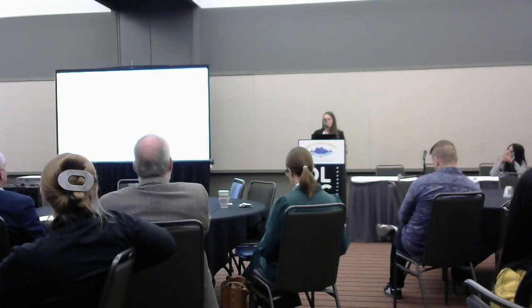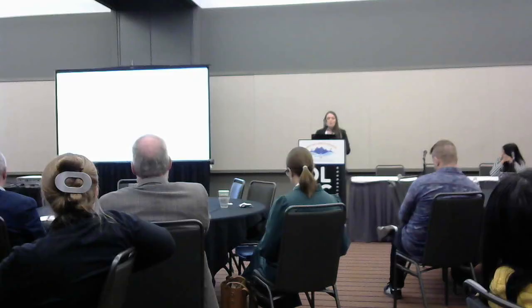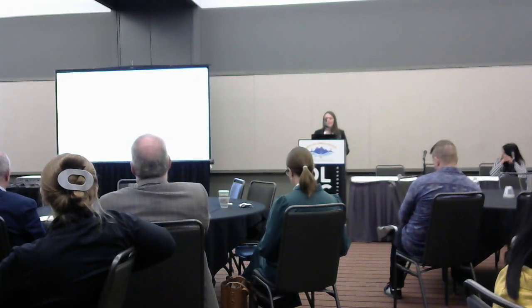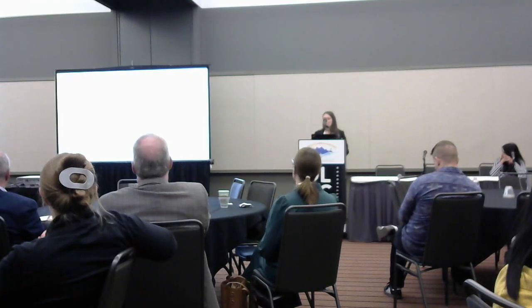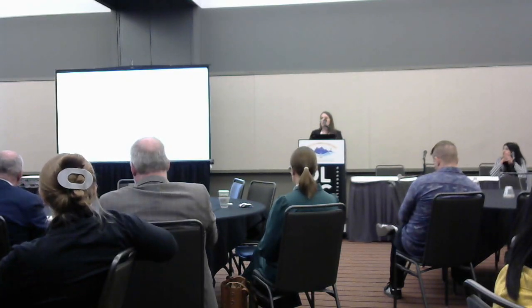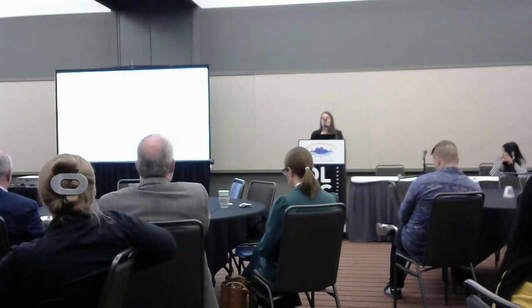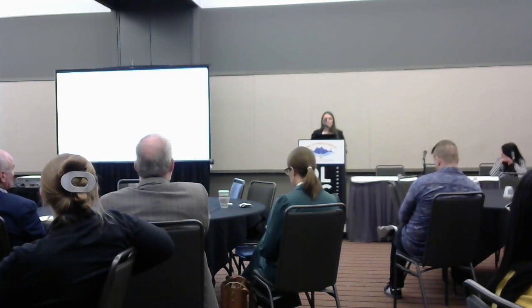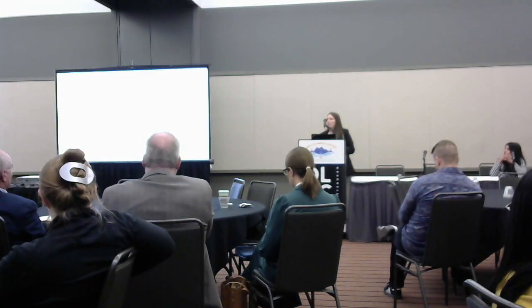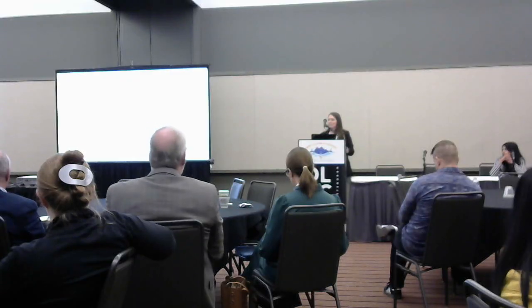Second, there's different styles of teaching that can be used to teach these things to new researchers. Demonstrations can be quite helpful, but also, maybe they don't quite teach the user to be independent right away. But I think overall what I've taken away from both of my experiences this past year is that an emphasis on decision making is maybe the most important aspect of this, because you're not always going to be there to help guide them. And then the last thing, choosing the right software is quite important. Lots of things to consider there, but it will kind of make the biggest impact on the analysis process.